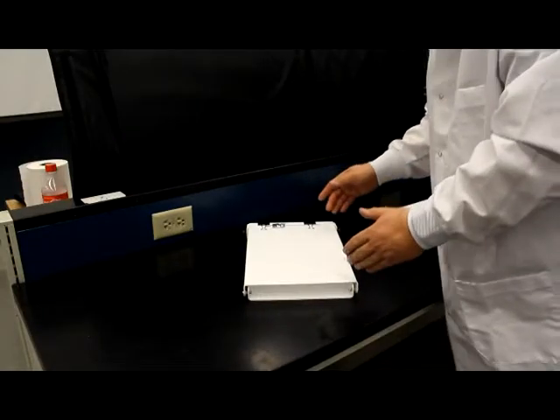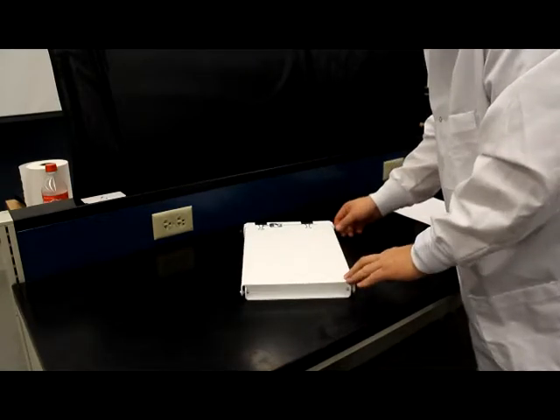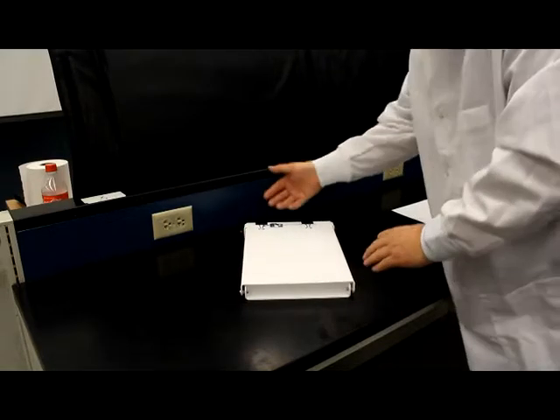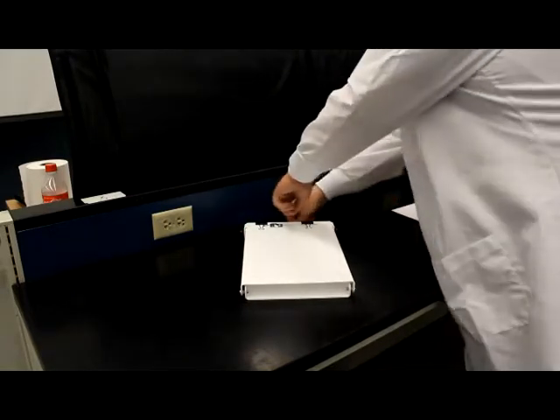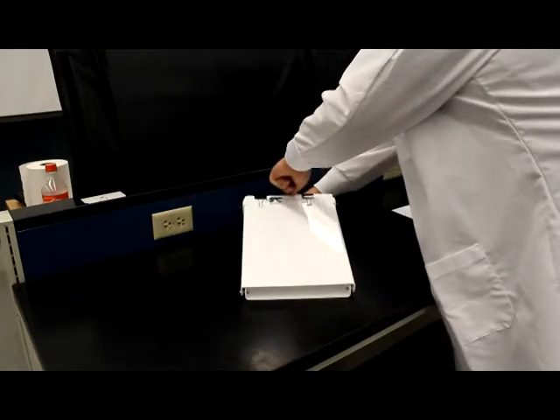The key to working with your apparatus, which should come tightened so that it doesn't open, is that you need to open the edges here. Now we have these two little knobs and they turn counter to each other. You want to go ahead and loosen them up, and then you want to check your apparatus to see if it floats or opens gently.